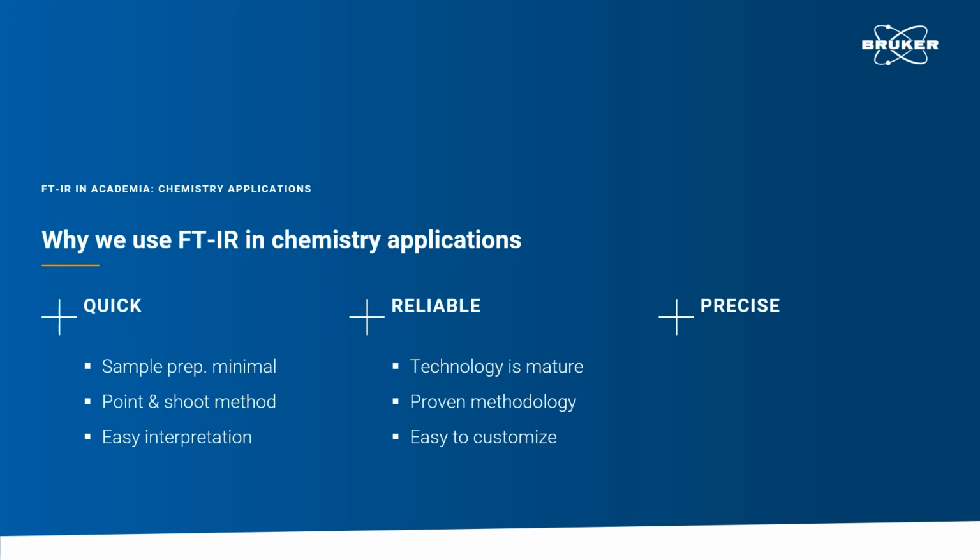Honestly, we all know what to expect when we measure an IR spectrum, and although there are some surprises in FTIR analysis, they are rare and all the more exciting. It is also very easy to customize, automate, and adapt to the special needs of the user. Lastly, it is precise and highly sensitive for a lot of analytical questions. It can be used to quantify contents in liquids, solids, and gases, and if you are interested in reaction monitoring of chemical and physical processes, it can offer time resolution into the nanosecond domain.